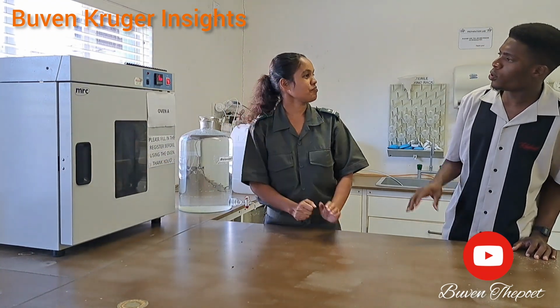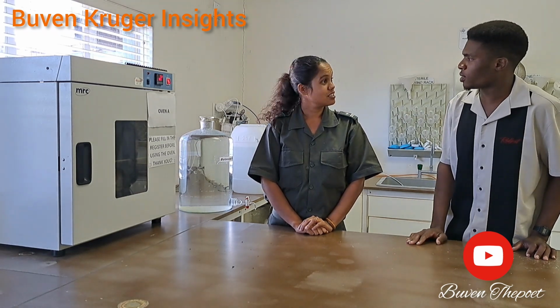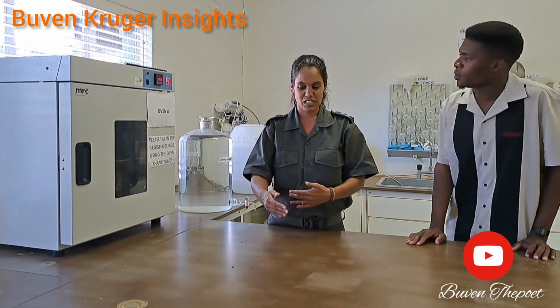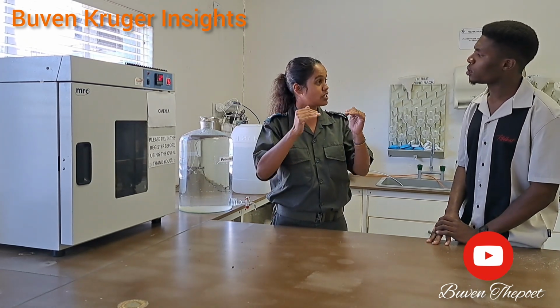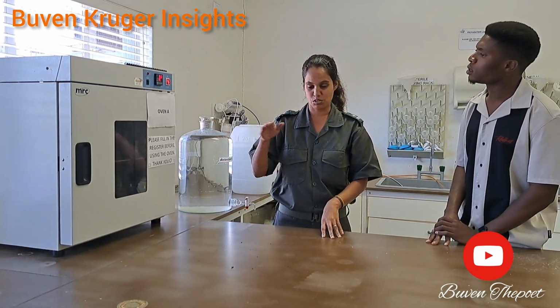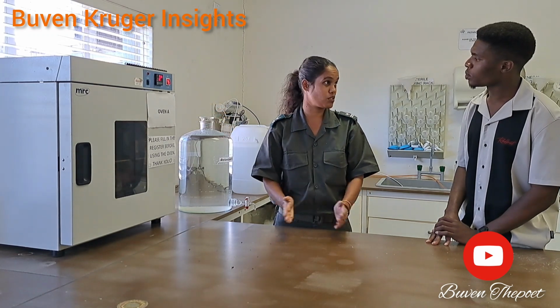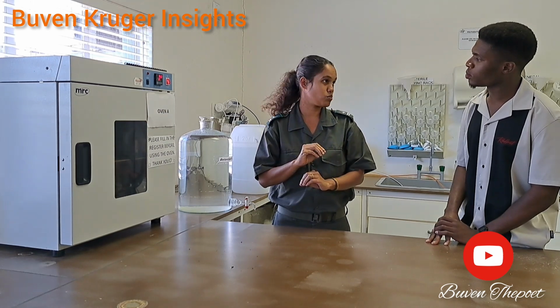So how do you know that you need 105 degrees Celsius for the soil and also 24 hours? The thing with science is that it's almost like a recipe that you follow when baking a cake. Over the years, people have worked out the ideal method to get you the right answer. They've run this many, many times and seen that 105 degrees for 24 hours is the best temperature and time needed to evaporate all the water. If I ran it at 50 degrees Celsius for 24 hours, there might still be water in the soil, but 105 is ideal to get all that water out.